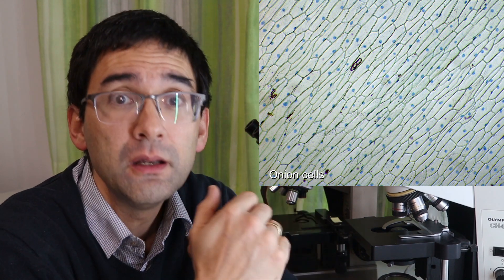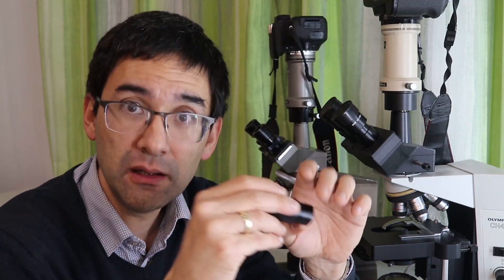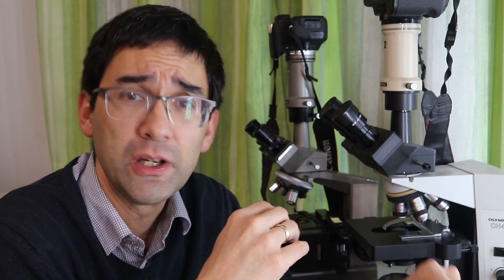Sure, they're not very big, but your microscope that you have can go up to a magnification using the 10 times eyepiece all the way up to 400. And if you use the 25 times eyepiece, you can get a magnification over a thousand times. Now I think it might not be very meaningful to do that because the resolution also drops. It's a little bit more blurry, but generally you have more than enough magnification.